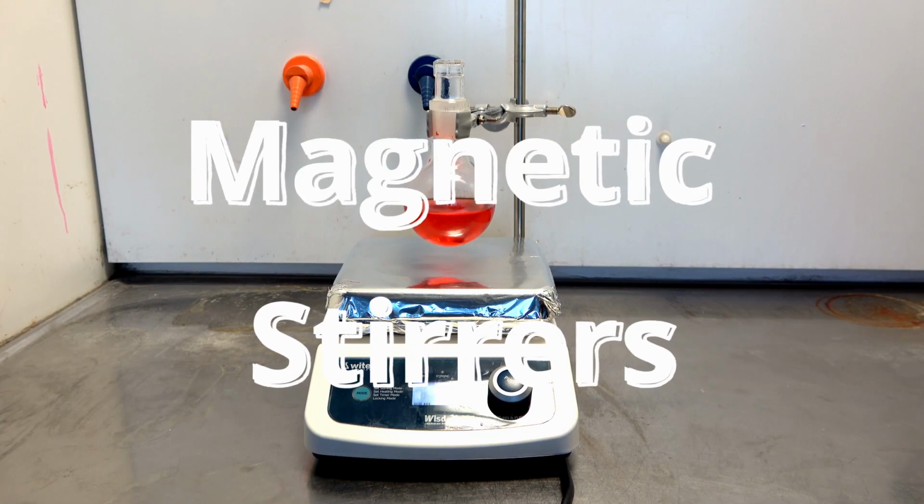A magnetic stirrer is a laboratory device that employs a rotating magnetic field to spin a magnetic stir bar immersed in liquid. A magnetic stirrer should only be used inside the ventilation hoods.